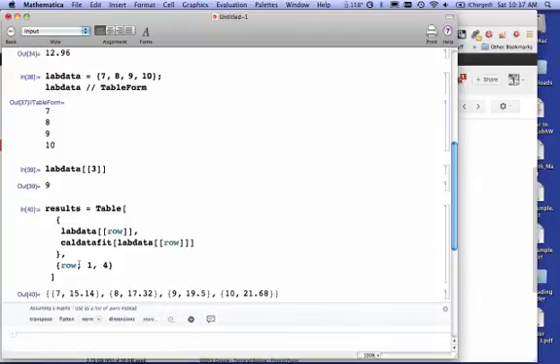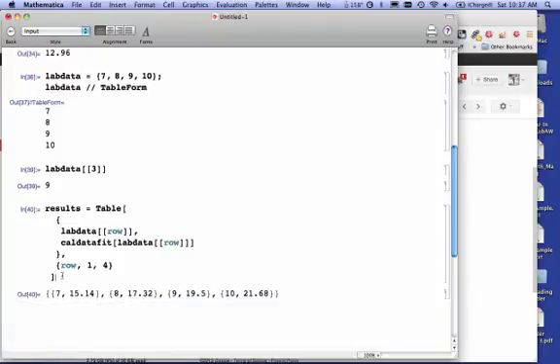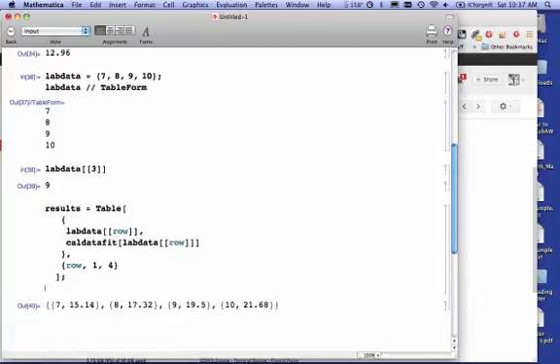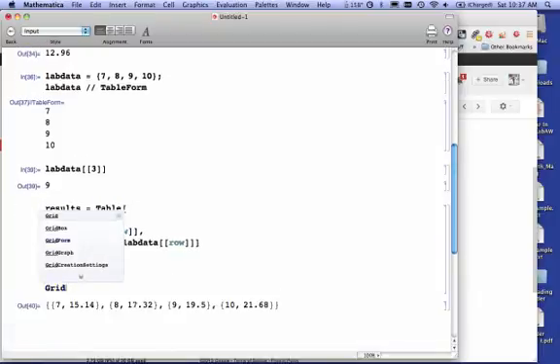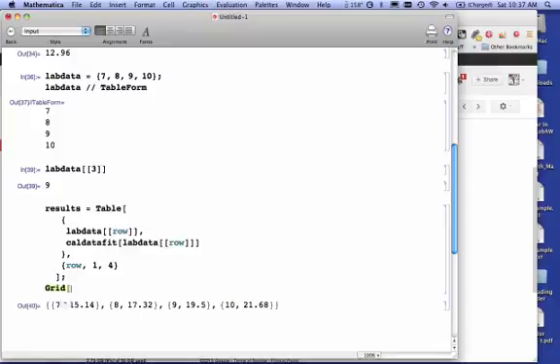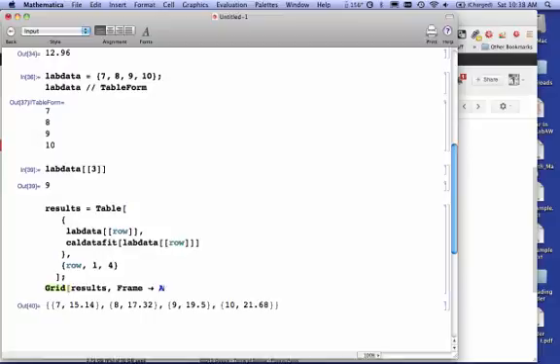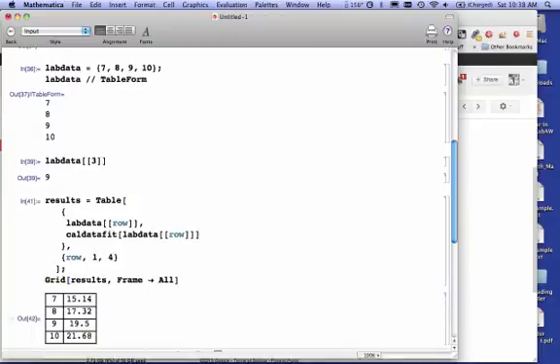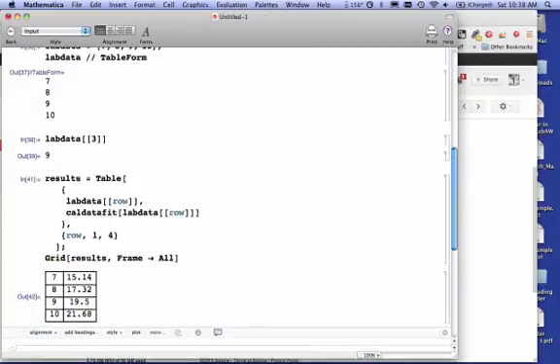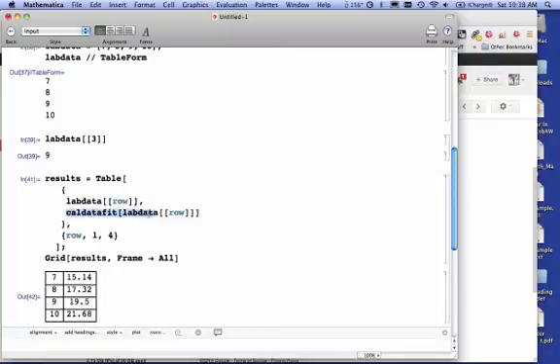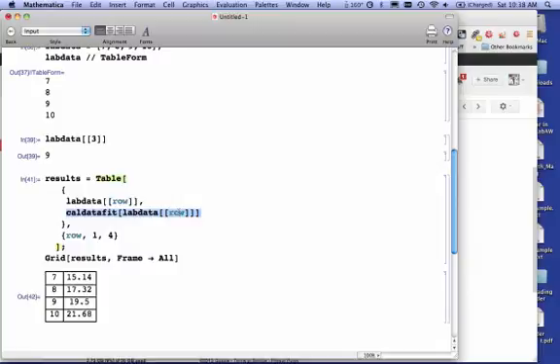there we go, I get my data, and probably what I want to do is I probably want to grid this data, so it looks a little prettier. We won't worry about labels, so there's my data.